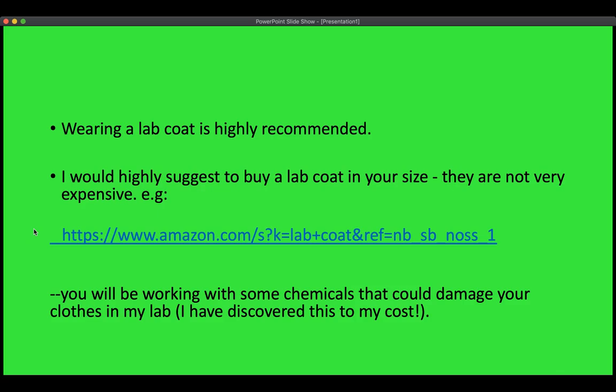Where you buy them is everywhere. There are several stores where you can buy high quality lab coats. Amazon provides inexpensive lab coats, okay? Why wear a lab coat? You don't damage your clothes. If some chemicals spill on your clothes while doing the experiments, they can damage your clothes in all sorts of ways: shrink them, discolor them, all sorts of things. So if you want to, you can wear a lab coat for this class, but it's not required.